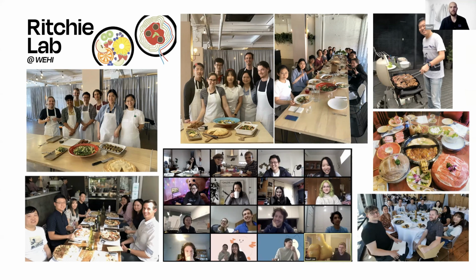That was an incredible talk. I'm certainly very excited about long read sequencing technologies being applied to single cell sequencing. If anybody's got any questions, feel free to unmute and ask. If not, drop them in the chat. I think we already had one, which Matt has nicely addressed, which is whether you could apply FLAMES to spatial transcriptomics data.